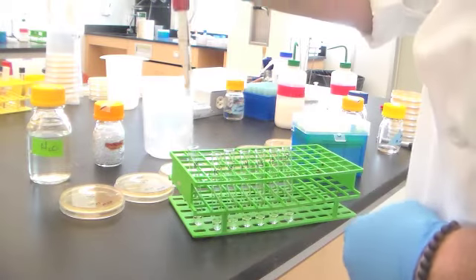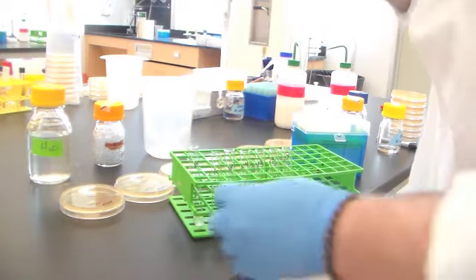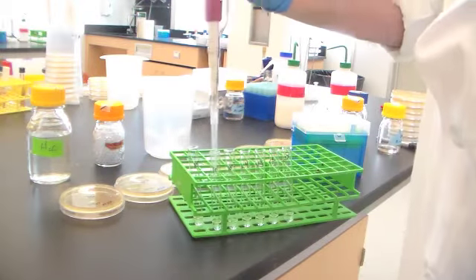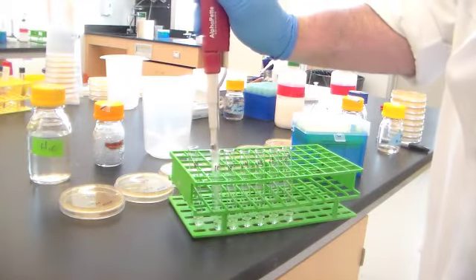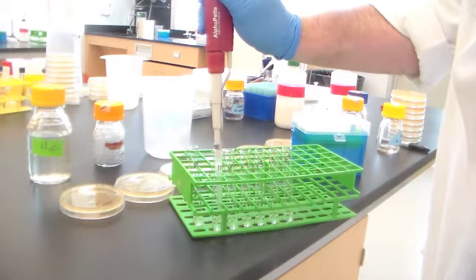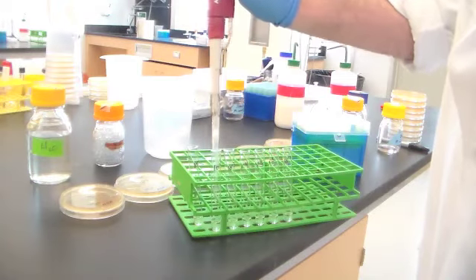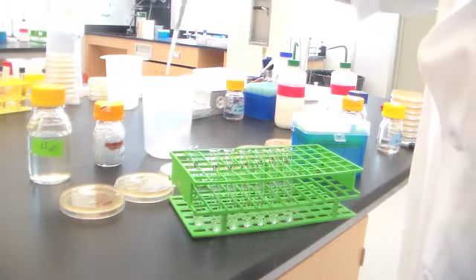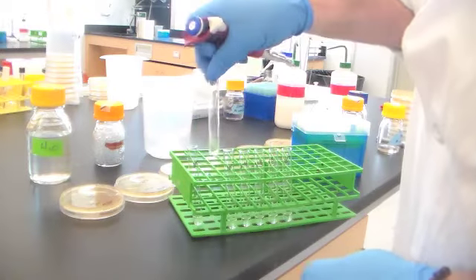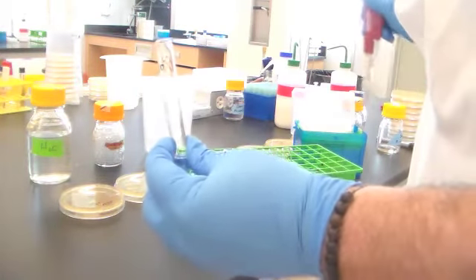I'm going to take 100 microliters from that 10 to the minus 1, and I'm going to put that into the 10 to the minus 2, and I'm going to pipette back and forth, or triturate, to rinse that pipette, push out to the second stop to make sure I've left it all behind, change the pipette tip. That's my 1 to 100 dilution, or 10 to the minus 2.